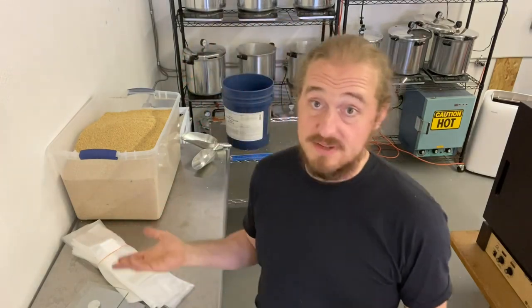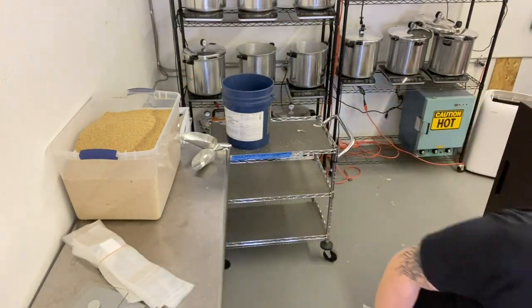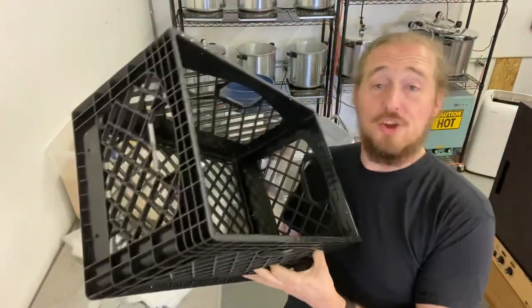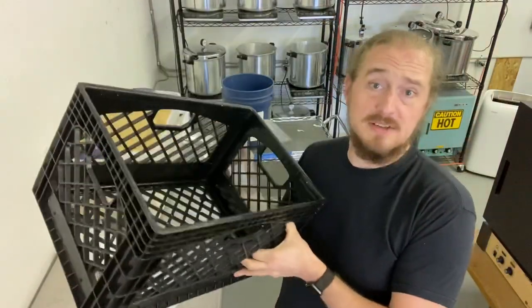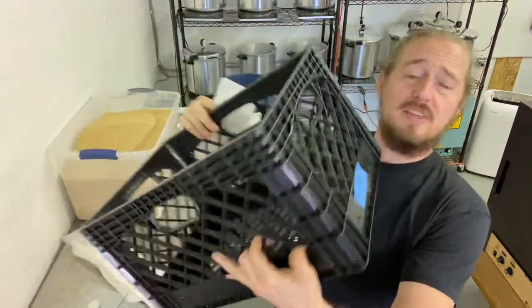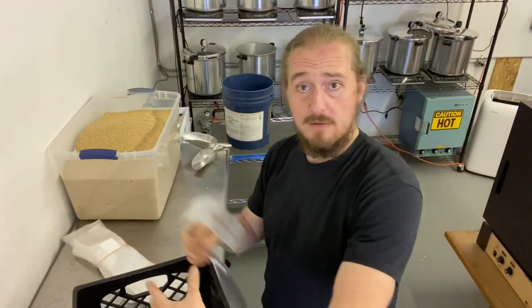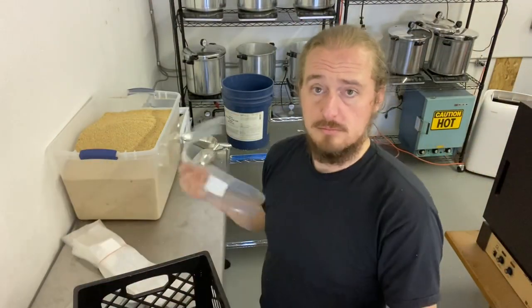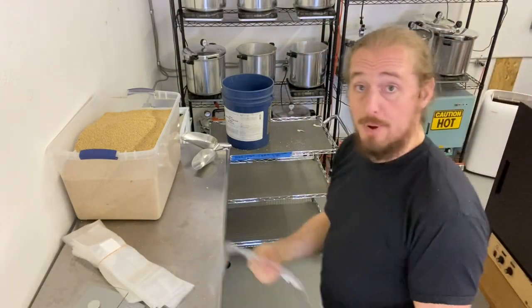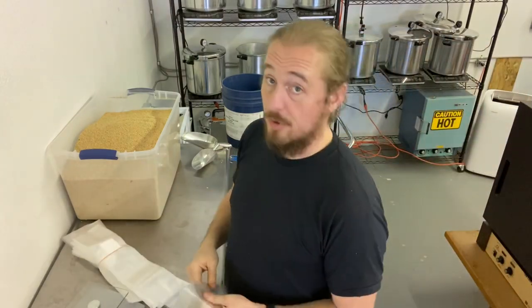Normally I prep these in bulk. If today's your first day, I've probably handed you a whole bunch of these crates. These are our grain crates - they are labeled 24 per crate. That's if you fill a bag, fold it over and stack them. But for this video, I'm going to show you how to do precisely one pressure cooker.